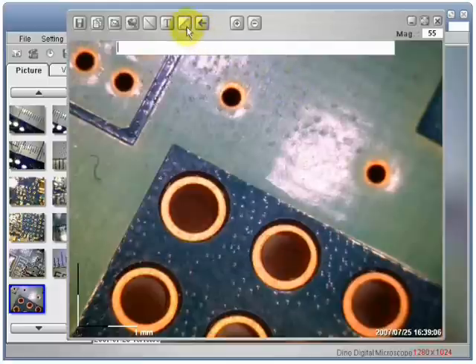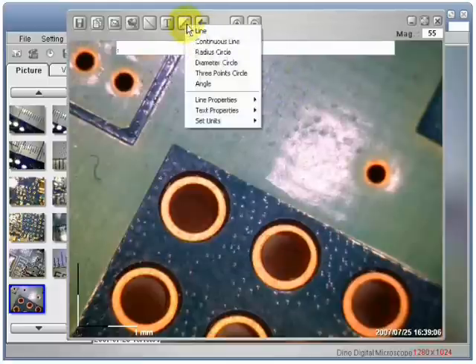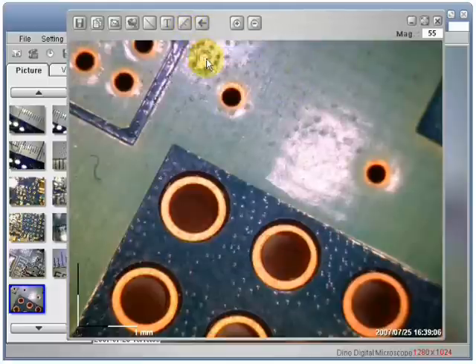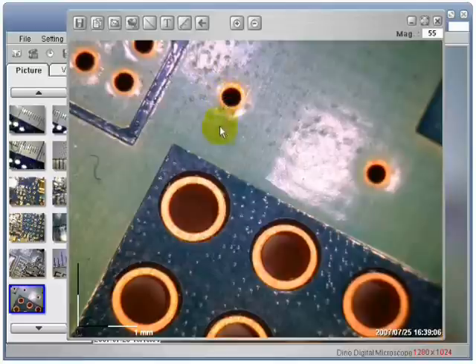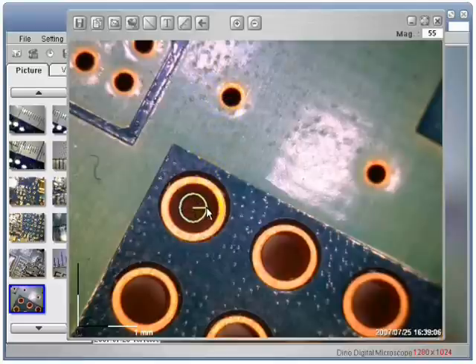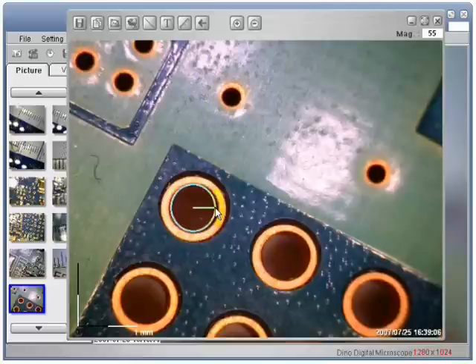Now I am going to choose to measure with the radius of a circle. Left click one time to start. Left click one more time to finish.